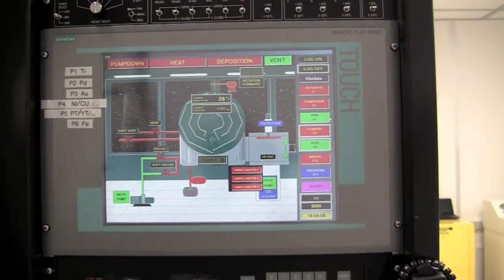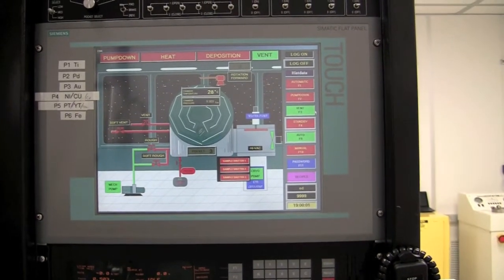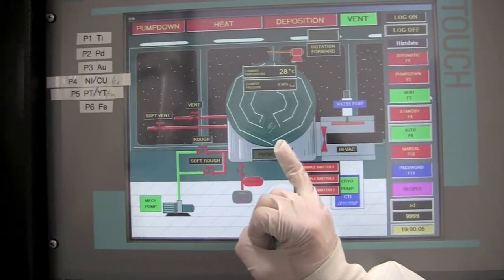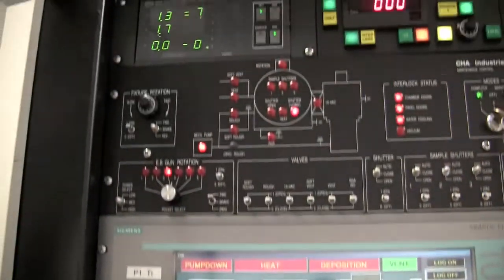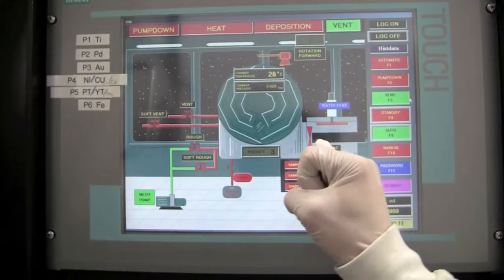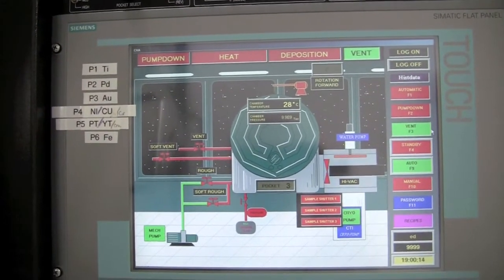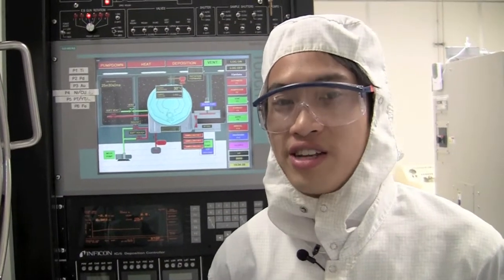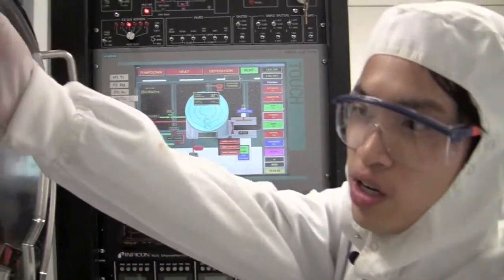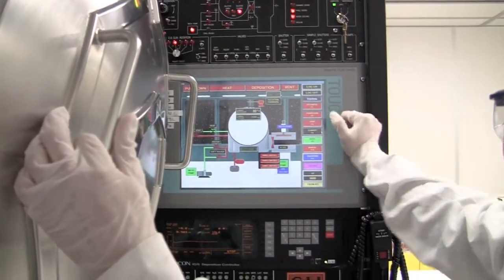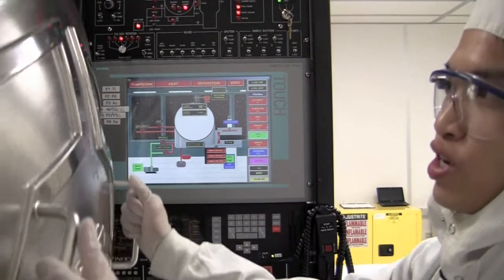We can once again verify this by the cartoon in the GUI and from the pressure gauge. We want to make sure that the HIVAC successfully closes during venting. Now that the chamber is vented back towards ambient pressure, we can go ahead and open the door to remove our wafers. Once again, we hit standby to stop the venting and we can pull the door down.